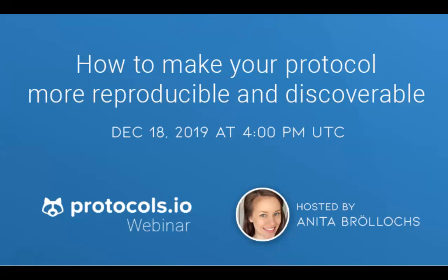And today's webinar, I'm very excited to share with you how you can make your protocol more reproducible and discoverable.